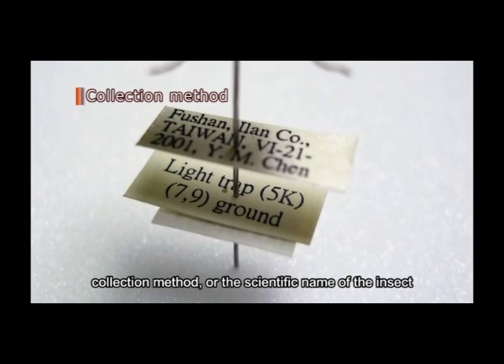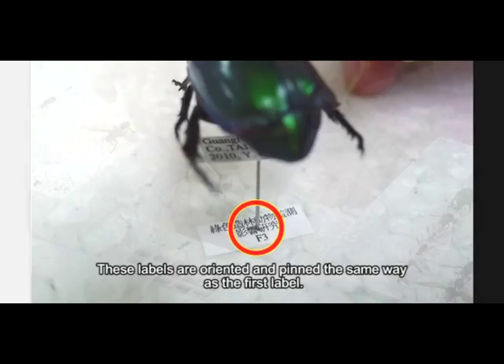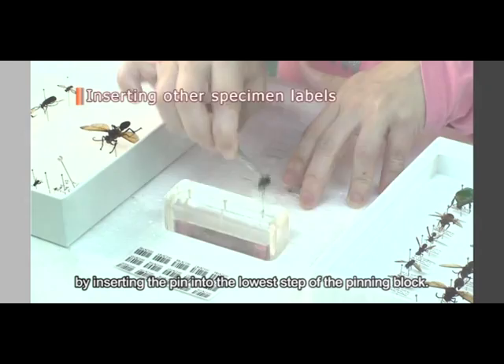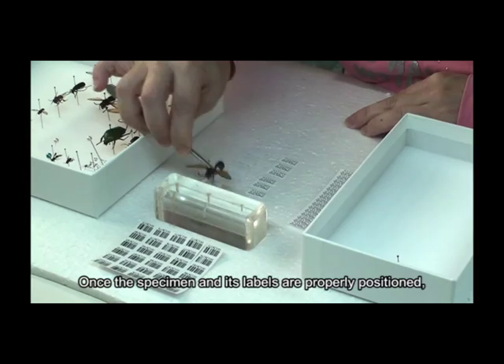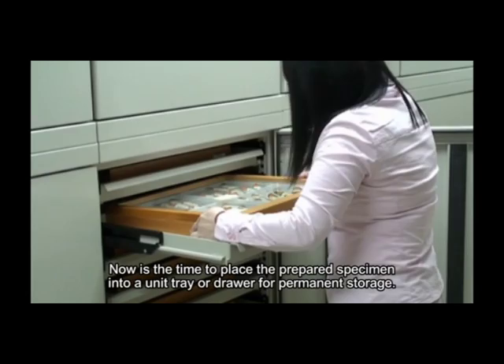Additional information, such as the host of the insect, collection method, or the scientific name of the insect, may be recorded on the second or third label. These labels are oriented and pinned the same way as the first label; they may be moved up the pin to the desired height by inserting the pin into the lowest step of the pinning block. Once the specimen and its labels are properly positioned, the specimen preparation comes to an end. Now is the time to place the prepared specimen into a unit tray or drawer for permanent storage.